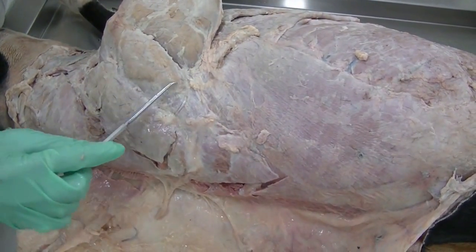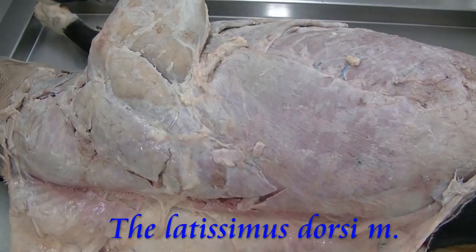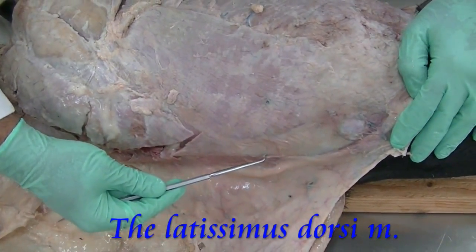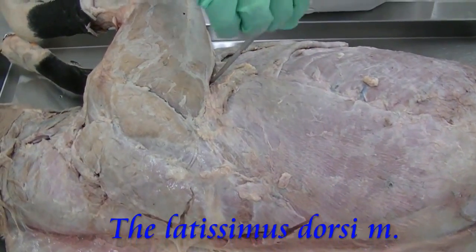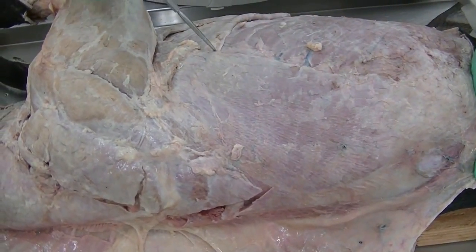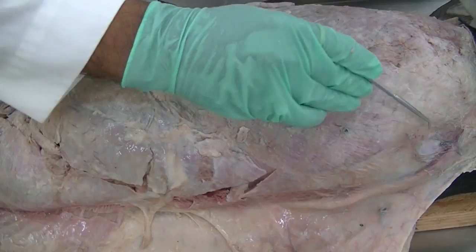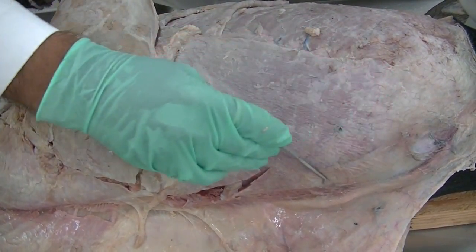So we see here, that is the latissimus dorsi. The muscle extends from the thoracolumbar fascia, and it further goes towards the humerus to get attached to the teres tuberosity of the humerus. That is the ventral border of the muscle, and we see the muscle fibers going towards the dorsal midline, where the aponeurosis seems to be merging with the thoracolumbar fascia.